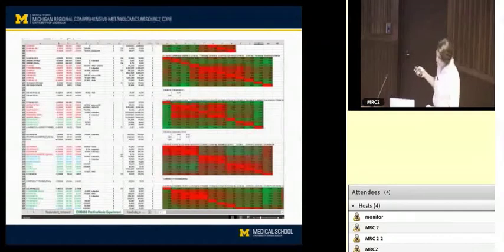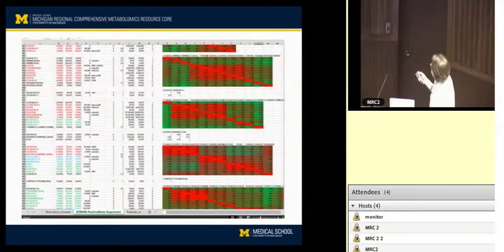Okay, so this is kind of like a big picture of what Binner does, and this is just a small part of all the ions that we detected for a particular study. This study had perhaps 4,000 ions, or features.